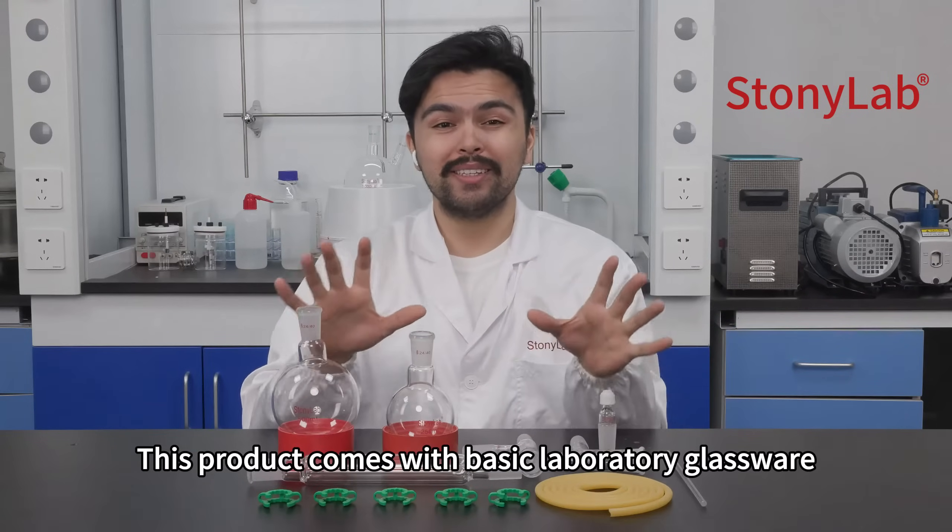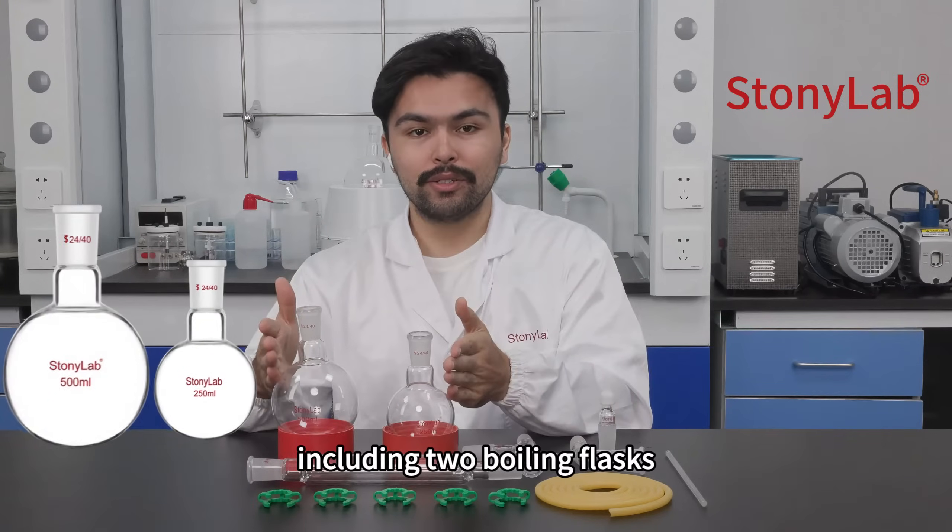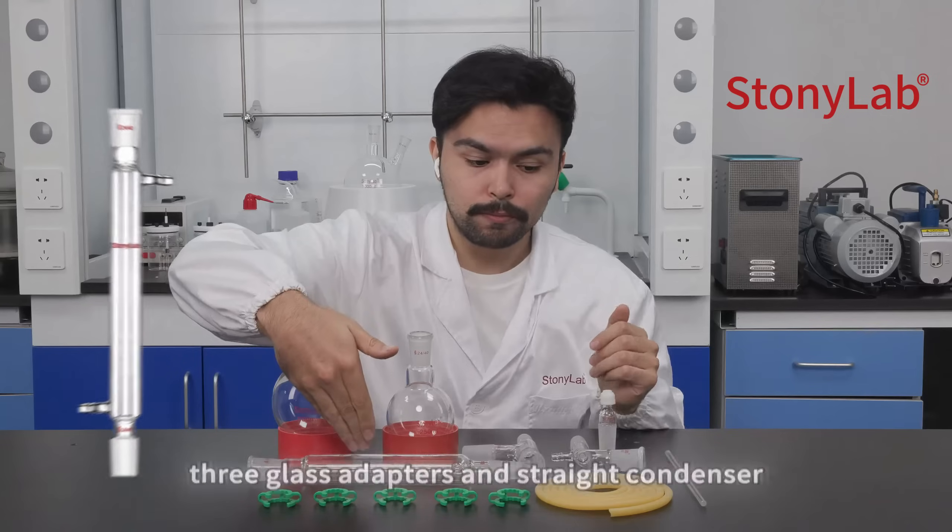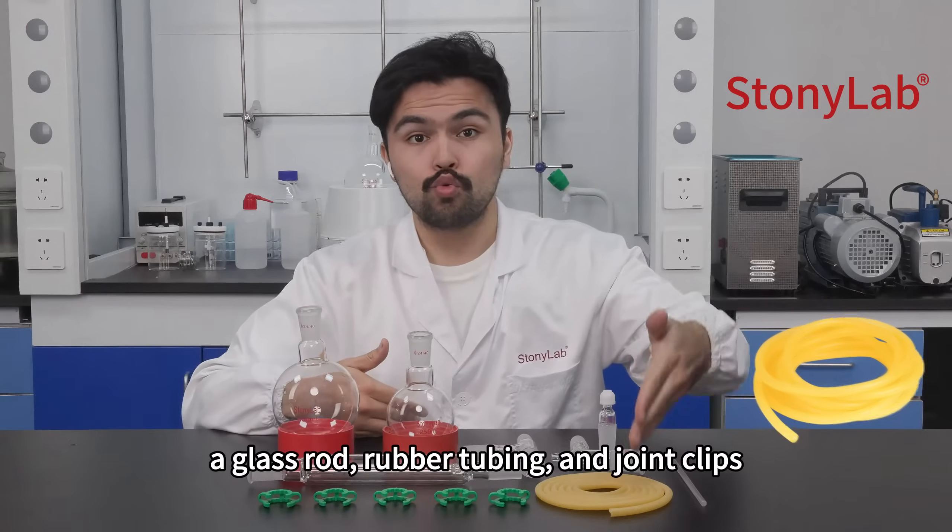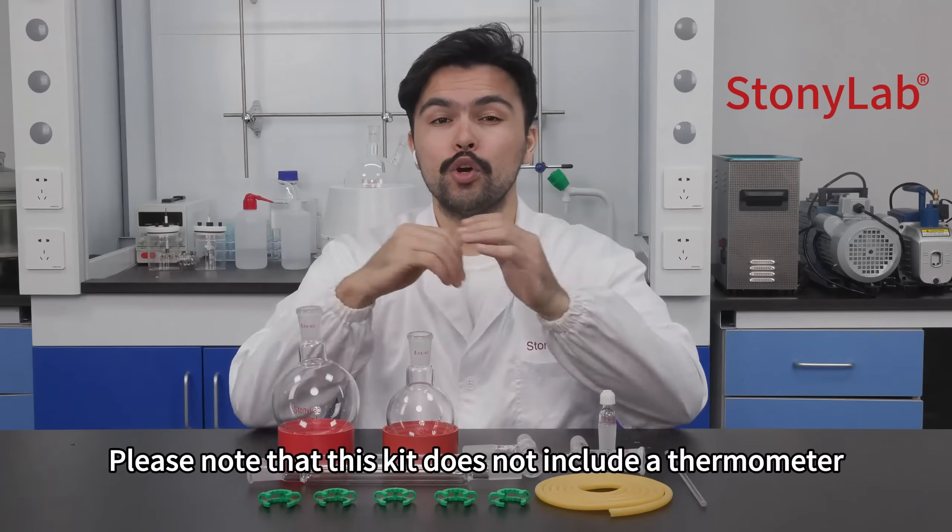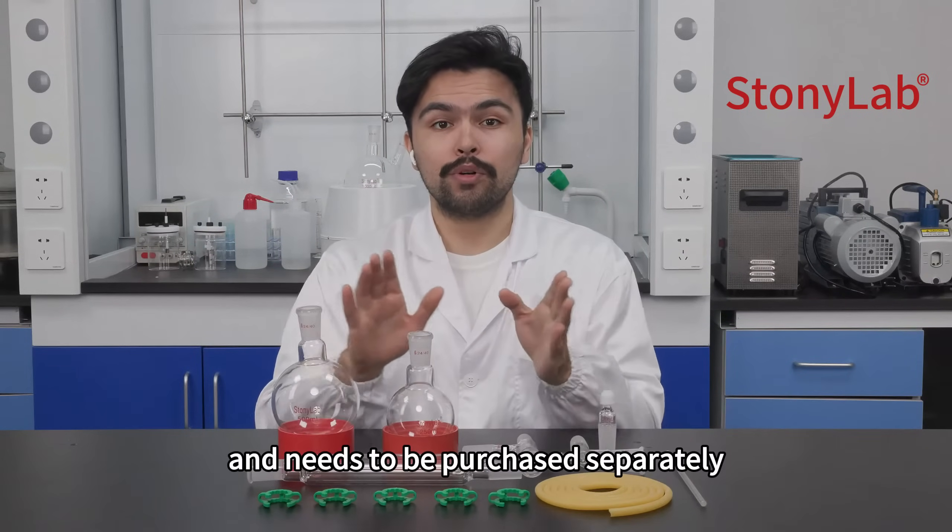This product comes with basic laboratory glassware, including two boiling flasks, three glass adapters, a straight condenser, a glass rod, rubber tubing, and joint clips. Please note that this kit does not include a thermometer and needs to be purchased separately.